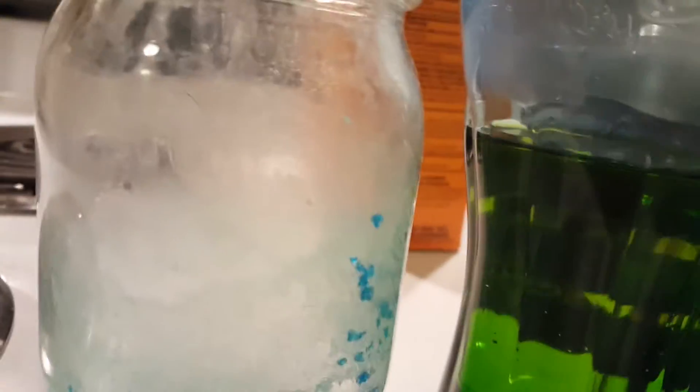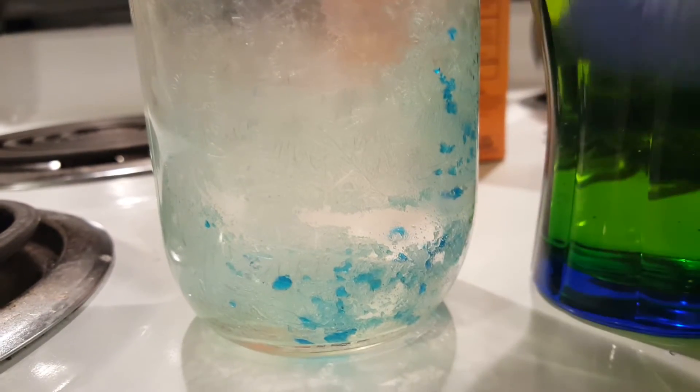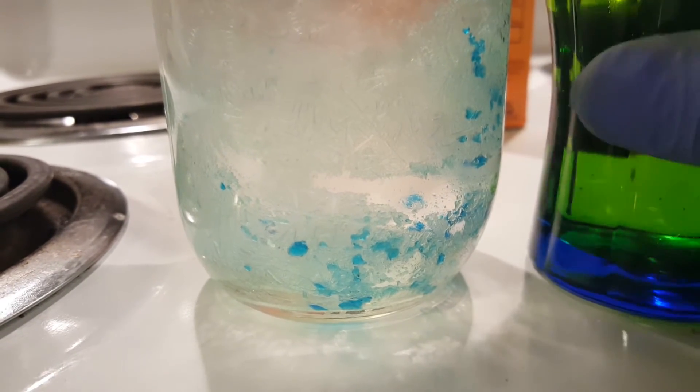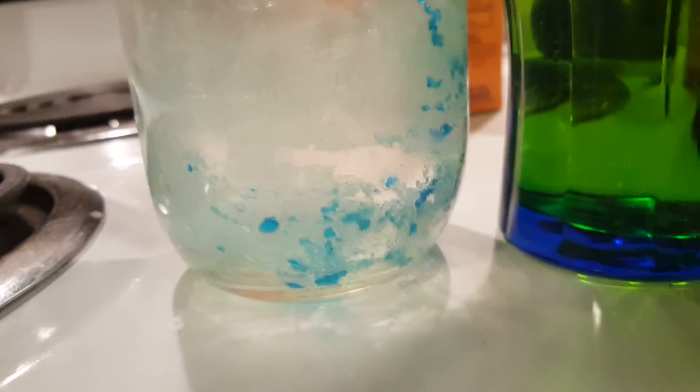Hello YouTube. Today I'm going to show you how to neutralize various reagents all at the same time. Today I made copper chloride, copper sulfate, copper tetrachloride, and an excess of hydrochloric acid, and I need to neutralize all of those at once.